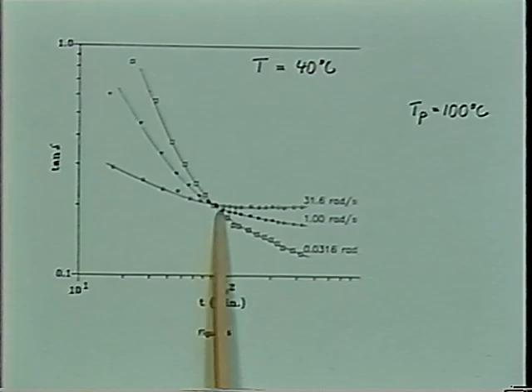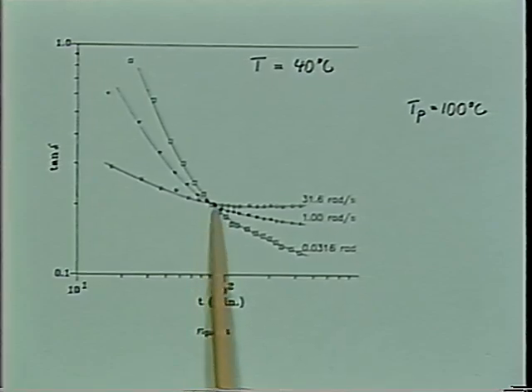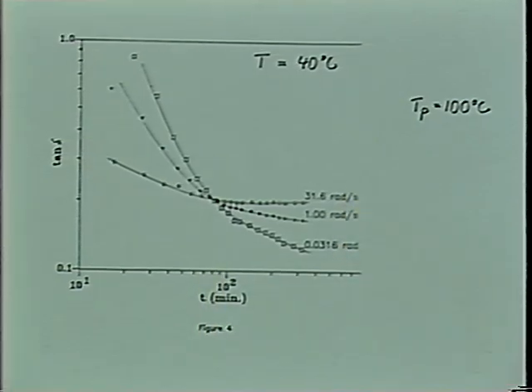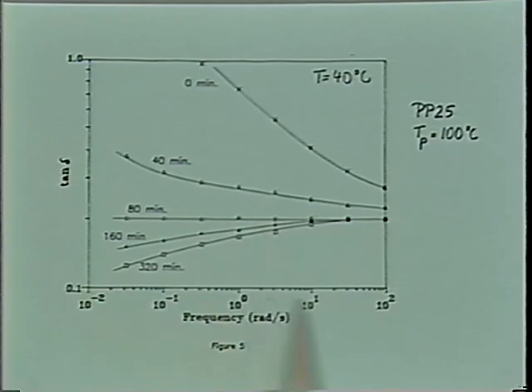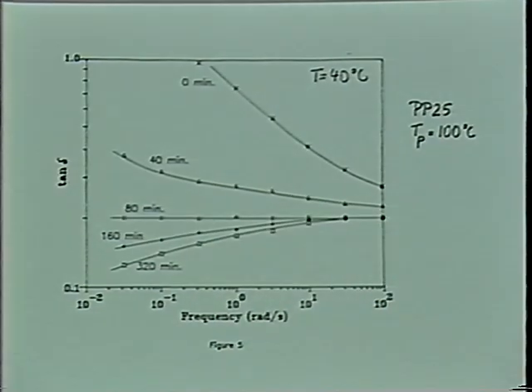We look at crystallization and find the gel point where tan delta is independent of frequency. And you see the frequency range is very large, in this case, much larger than in Klaas Tenhuis's experiments. Tan delta is amazingly linear over a wide frequency range. This is a real ideal behavior. We haven't seen anything nicer in a chemically complicated system. So in spite of all the differences between the physical and chemical gel, the behavior is still very, very similar.